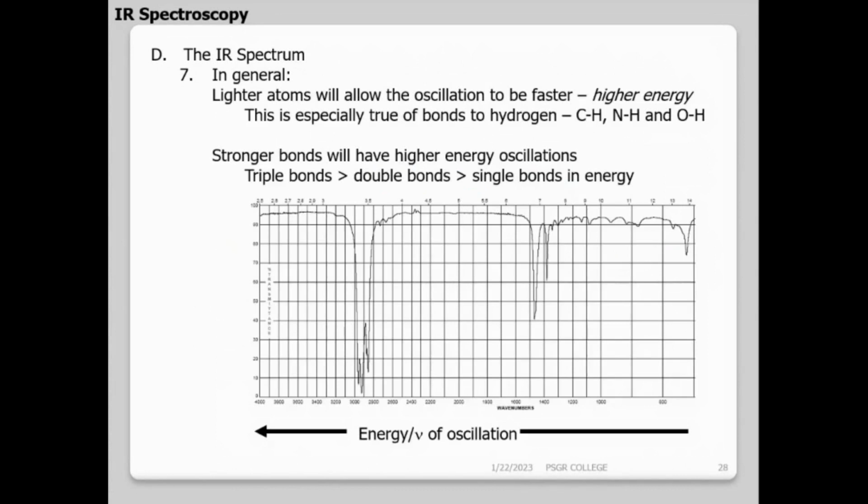Generally, we can divide the IR spectrum into regions. So I go from 400 to 4000, or I can say 600 to 4000, whatever. Now how do I divide the regions? What have we studied so far? The y axis. What have we studied on the y axis? Percentage transmitted.